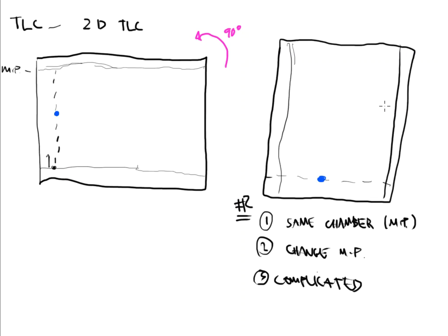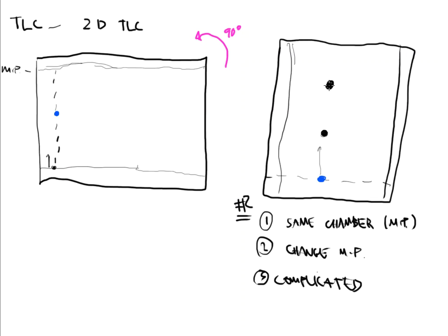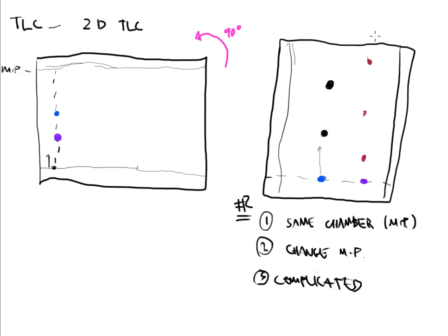So I'll lower this back down into a chamber, put the lid back on it, develop it again just like I did the first time, and this spot will begin to migrate. And I might see a different migration pattern, or maybe at this point it will turn into two spots. Or maybe in the beginning, if this was a complicated sample, we would get a second spot here, and that second spot maybe would be right here when I turn the 90 degree plate around. And maybe that spot will go into three.